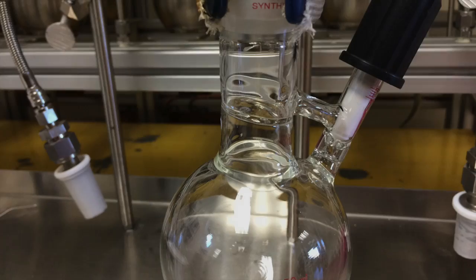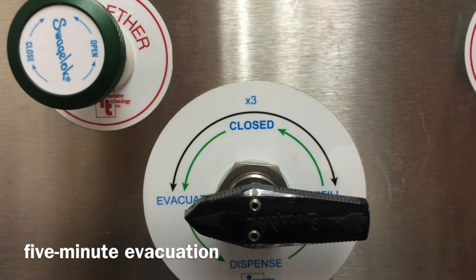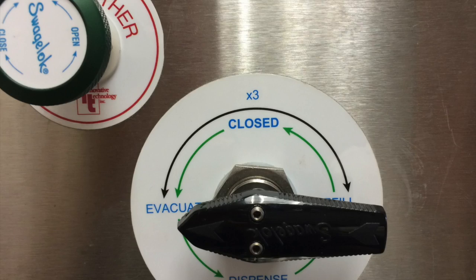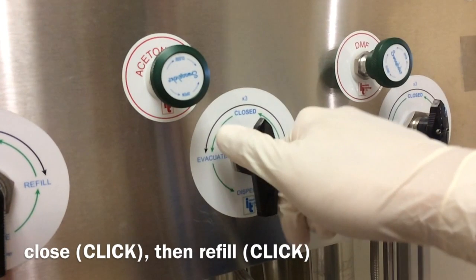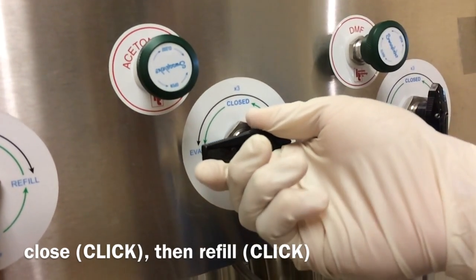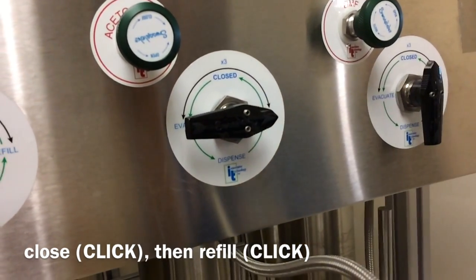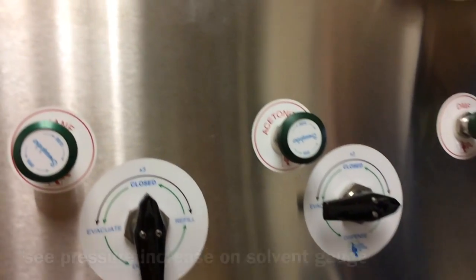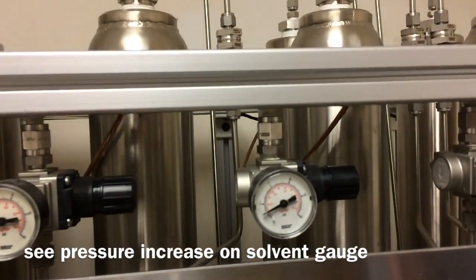To purge the flask, the Teflon valve should be open. You should pump down on this flask for about 5 minutes before refilling with inert gas. To refill the flask with argon, slowly turn the valve to the closed position and wait for the click. Then turn the valve to refill. As your flask begins to fill with inert gas, you'll see that the pressure gauge above the solvent still begins to increase in pressure.